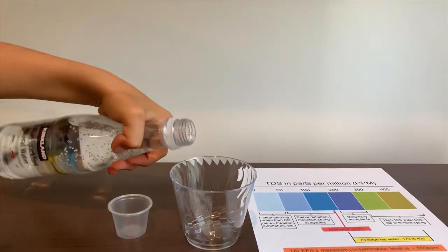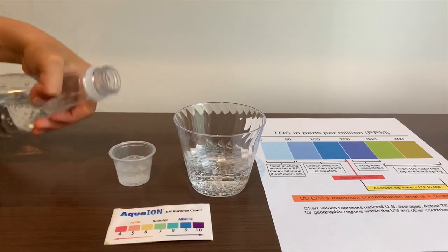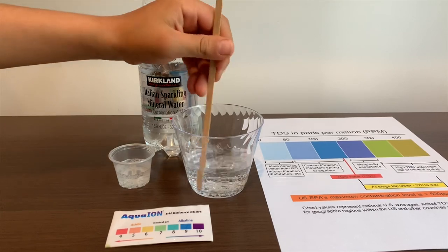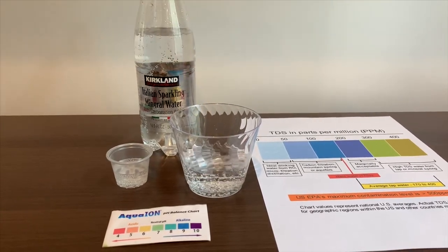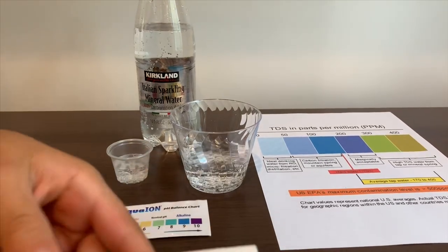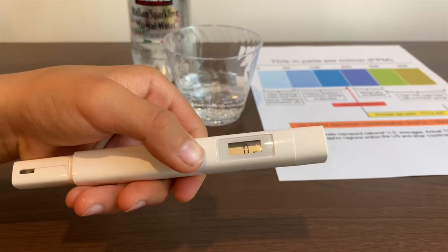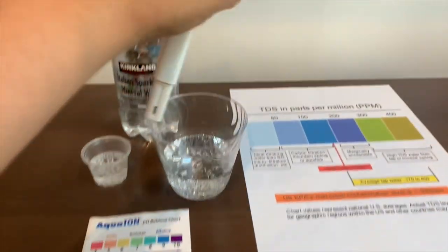Let's pour some water in. First, we're going to test the TDS level, but first let's stir it a little so we'll get a better result. If you want to buy this TDS tester, check down below. Turn on the TDS tester, make sure it says zero, and put it in.